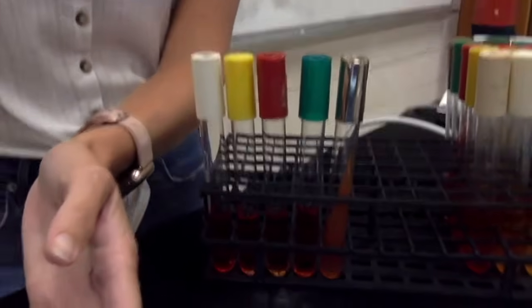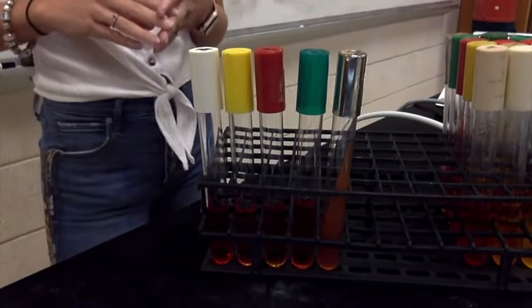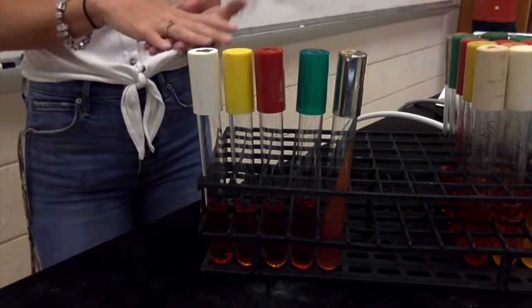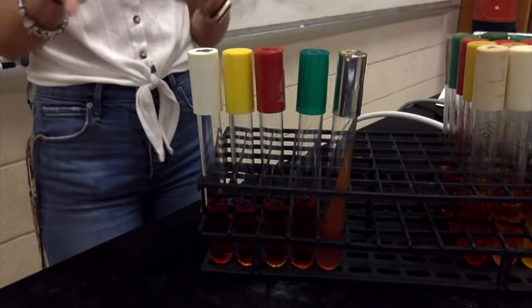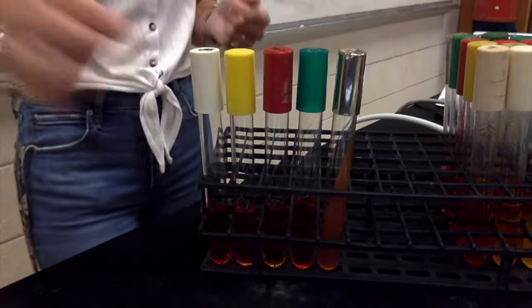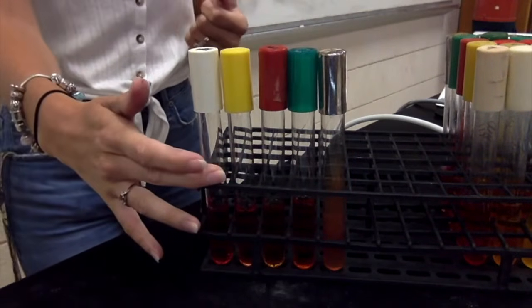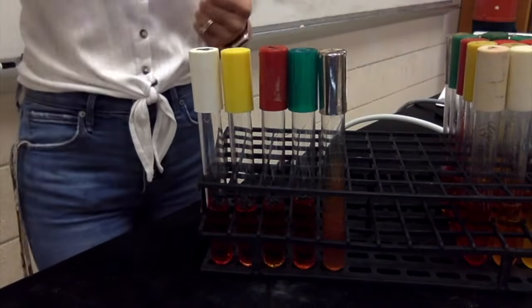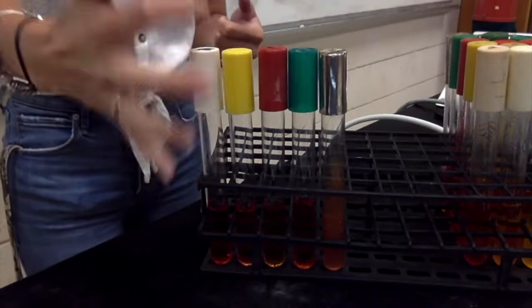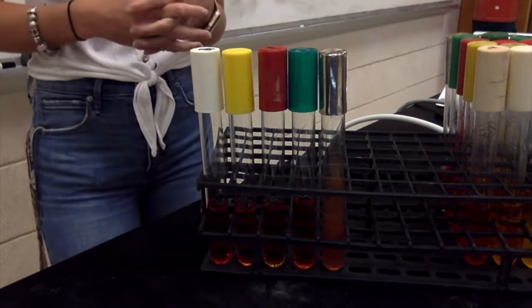Now, you don't have to worry about the colors of the caps. You don't have to memorize that. That's all in your lab manual under the procedure. It'll tell you which sugars are which cap color. But I always just try to match the order of which I put it on the board. So that's the order that I have it up on the board: lactose, glucose, sucrose, and mannitol. So that's how I always like to keep it.